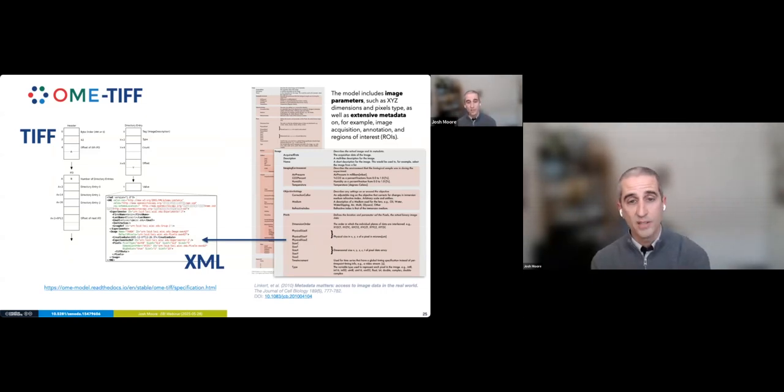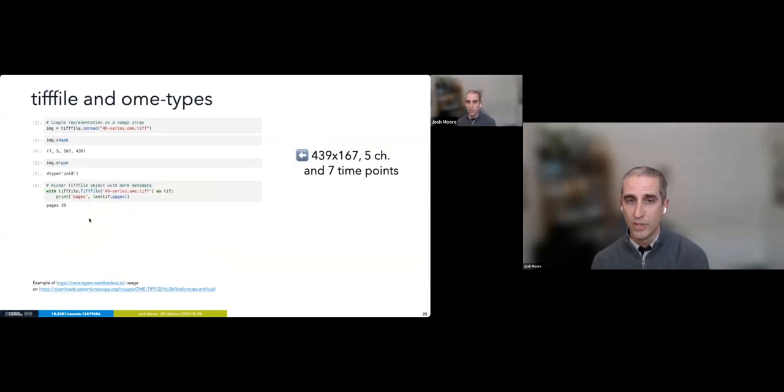And with that, you've got something that's this higher dimensional structure, right? That's the basis of the specification. And so something like tifffile is reading that XML to figure out what your data looks like. And so very briefly, again, I can share a link to these Python files if anyone really wants to look at them. There's another data sample that's in our repository. You can download it. It's, I think, tens of megabytes. It's pretty easy to work with.